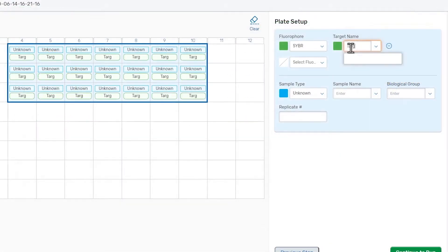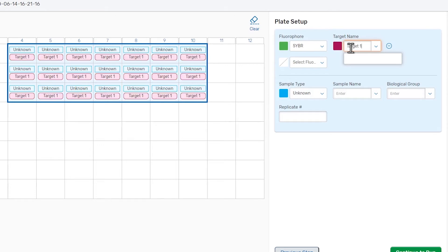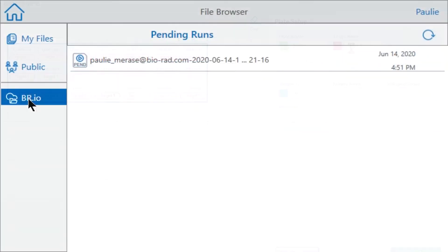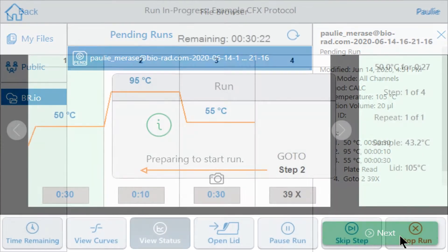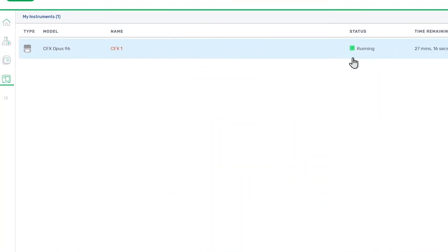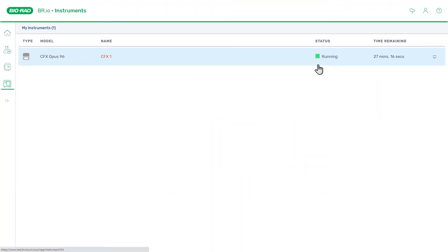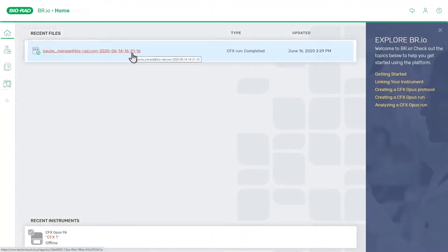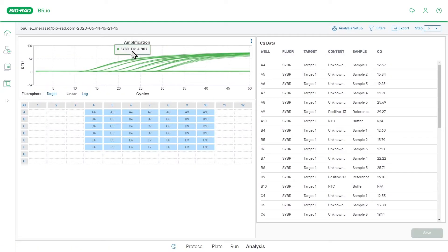Runs are set up in the cloud, then initiated using the instrument's touch screen. While running, the progress can be monitored remotely. And upon completion, your data are available automatically in the cloud where they can be analyzed and exported.